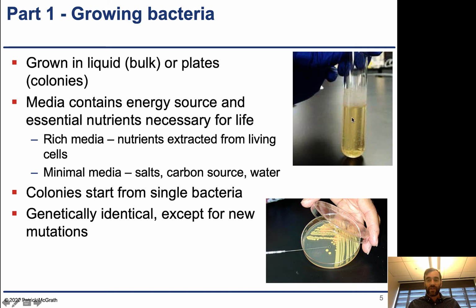And then you would also take a little bit of this liquid and put it on this plate and spread it around, and then you would create colonies. These are what I referred to before, these little circular things. So there's two colonies right here. Each of those colonies grew up from a single bacteria. So all of these bacteria within the colony are pretty much genetically identical to each other, because they're all produced by this exponential process of one cell becoming 2 cells, becoming 4, 8, 16. And so if you wait long enough, you're actually talking about millions of cells that have been produced.